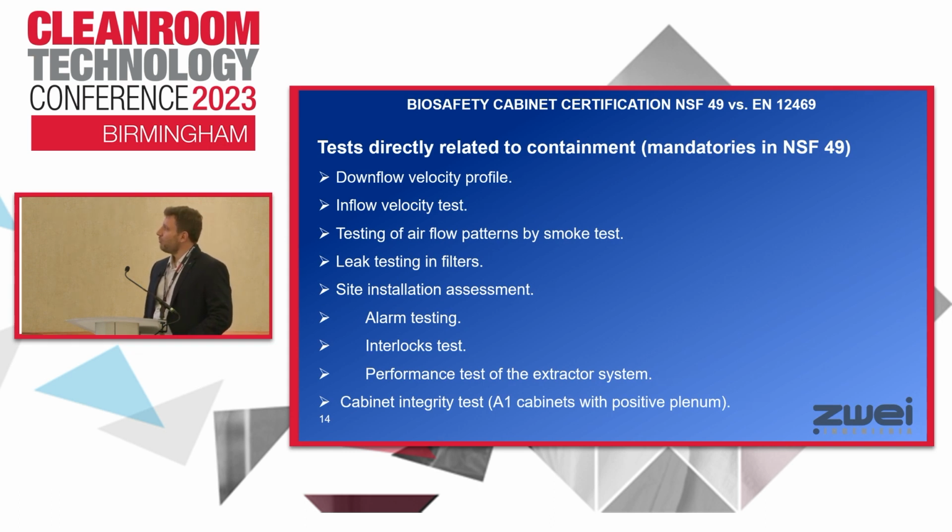Testing of airflow patterns by smoke test, leak testing of the filter, and site installation assessment, which includes alarm testing, interlock testing, and performance testing of the extractor system. And for A1 cabinets with positive plenum, a cabinet integrity test.